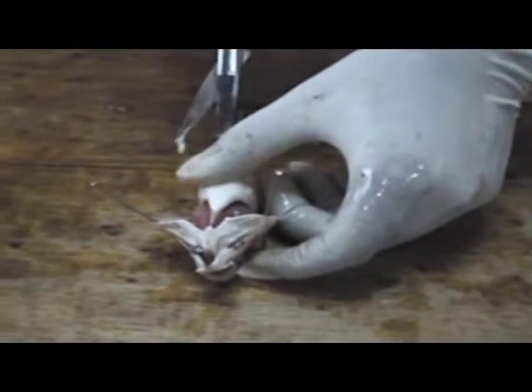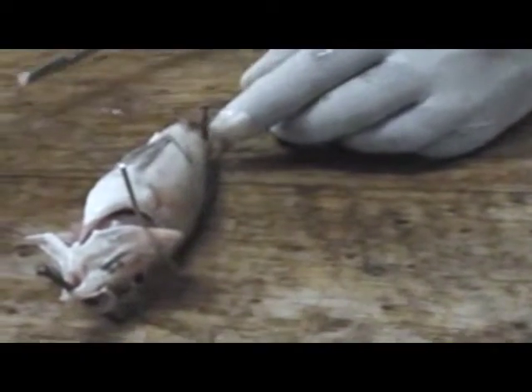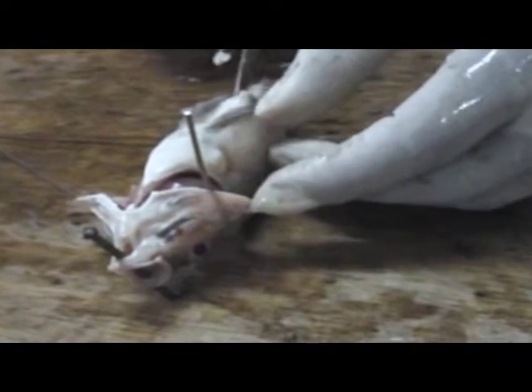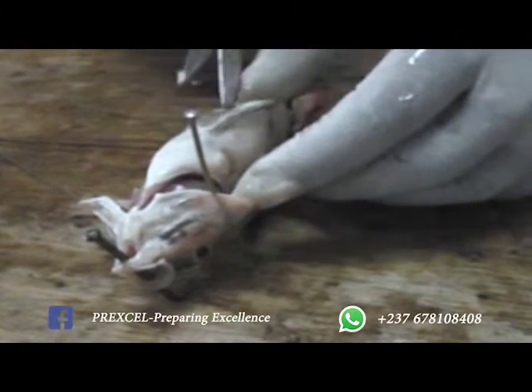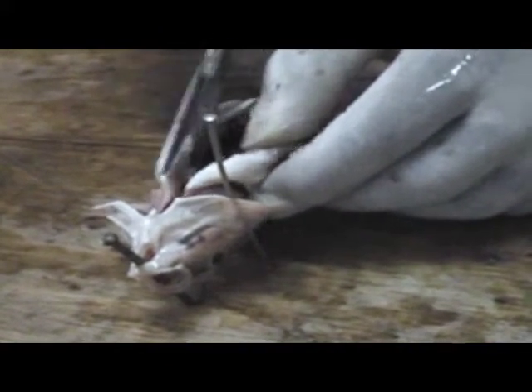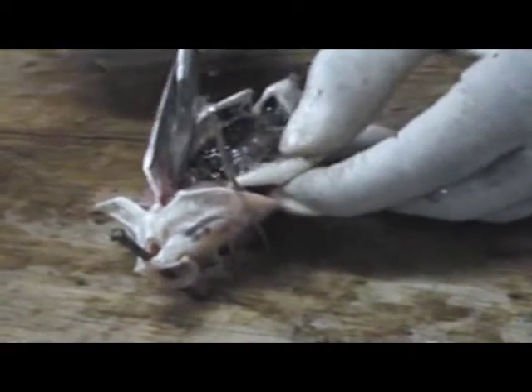We make the incision down like this, then we extend it a little bit to go down both ways. We cut up in the median, cut it up in the middle, putting our blunt end of the scissors inside and the sharp end remaining outside. We cut it up like this till we reach the area where it joins to the gills, and we stop there.